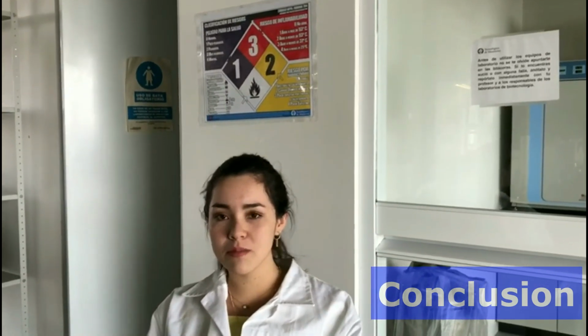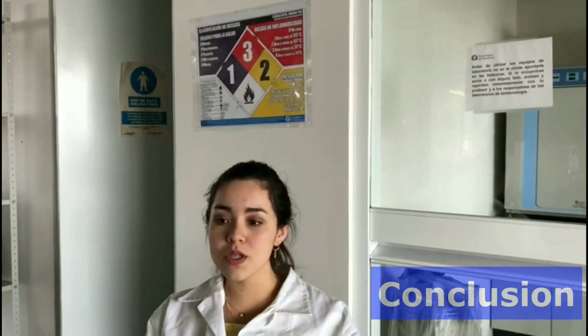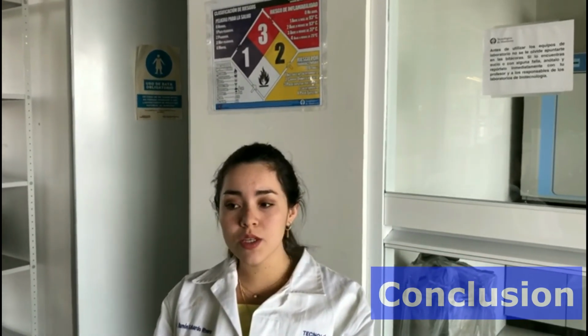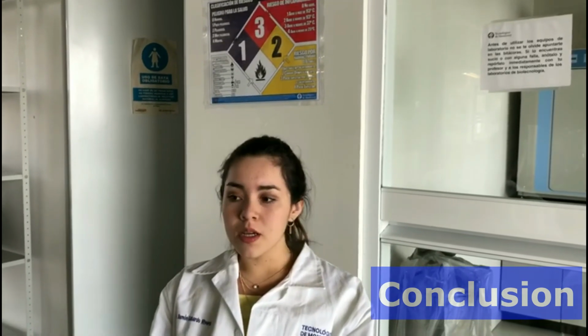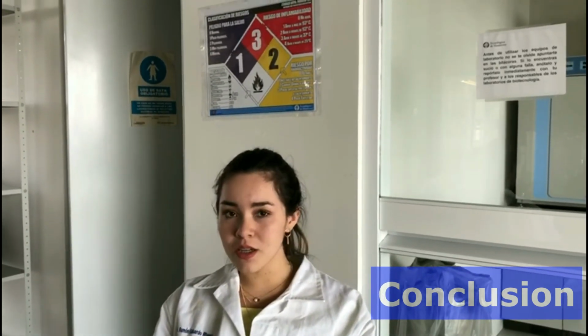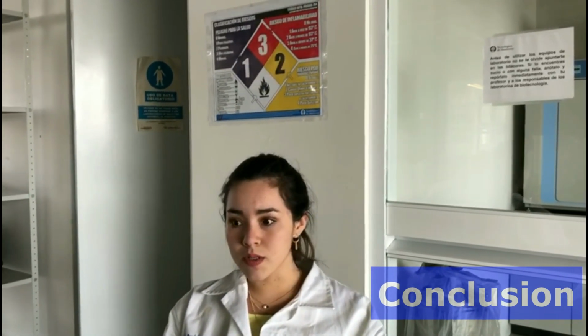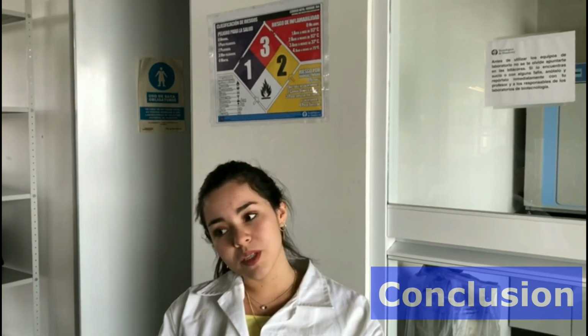The knowledge of the security measures, as well as the function and adequate use of the materials, equipment, and substances used in the genetic engineering laboratory will allow a correct manipulation of the instruments in future practices, which is useful to work efficiently inside a laboratory. In addition, the mastery of pipetting techniques and methods will allow to obtain accurate results and therefore a correct interpretation of them.